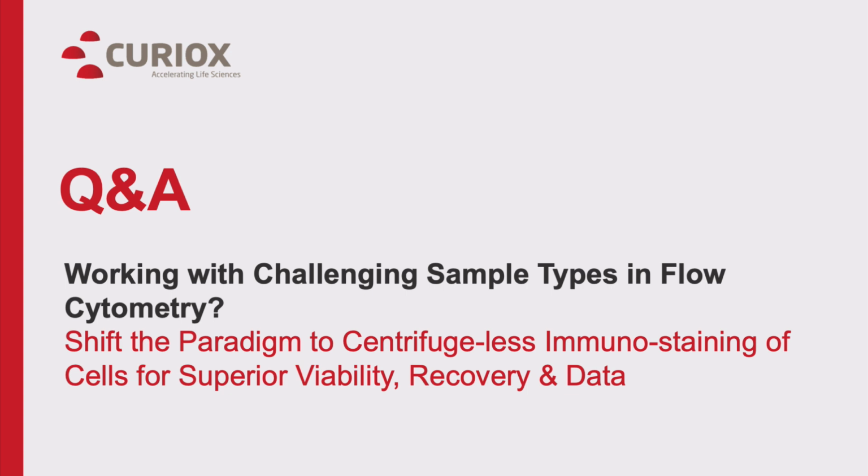Great. What are the speeds used with the data presented? That's a good question. So the cycles, I think for most of the data that was presented, the wash cycles were about 2. Each of those cycles lasts from anywhere between 2 and 5 minutes. I think the bulk of the cycles were for a 2-minute, and the flow rates, I believe, were somewhere between 5 and 10 microliters per second.